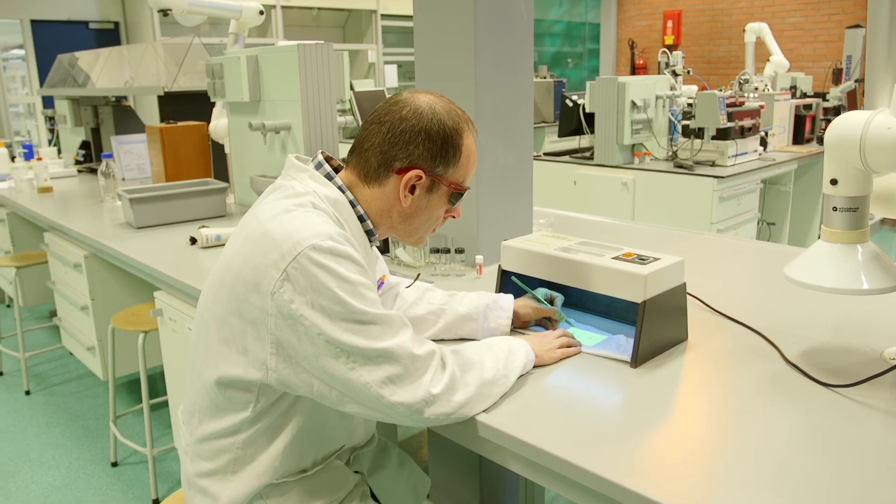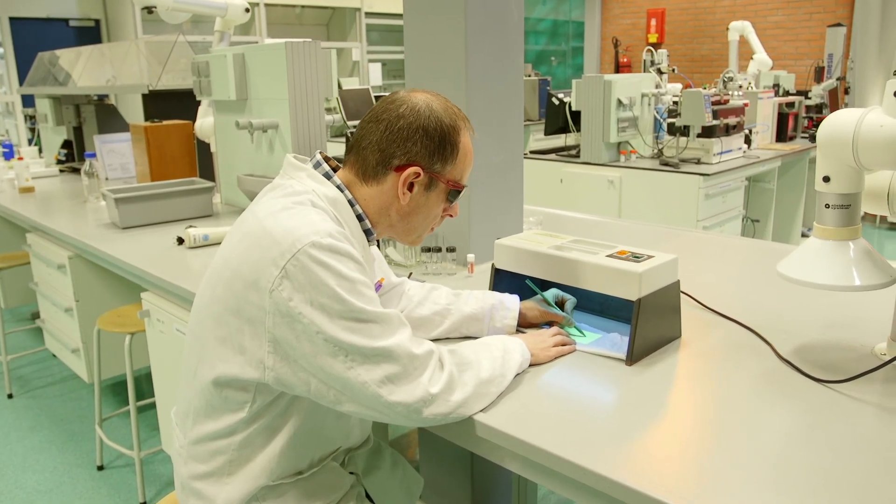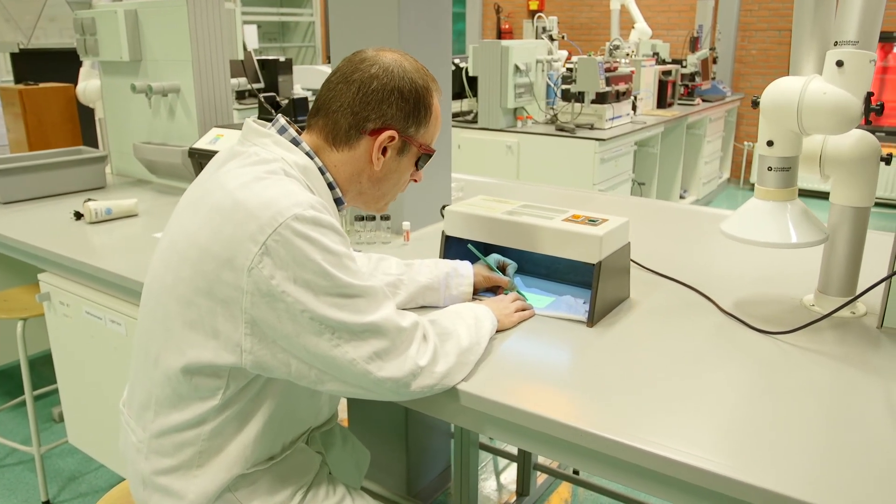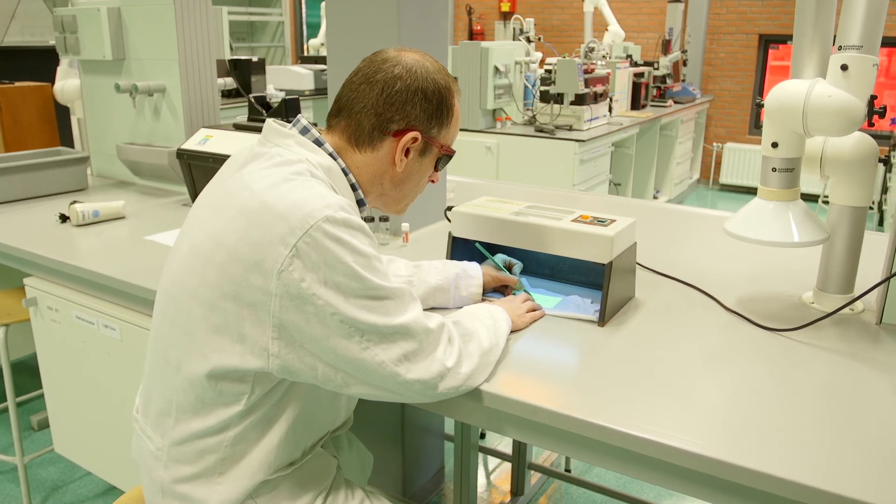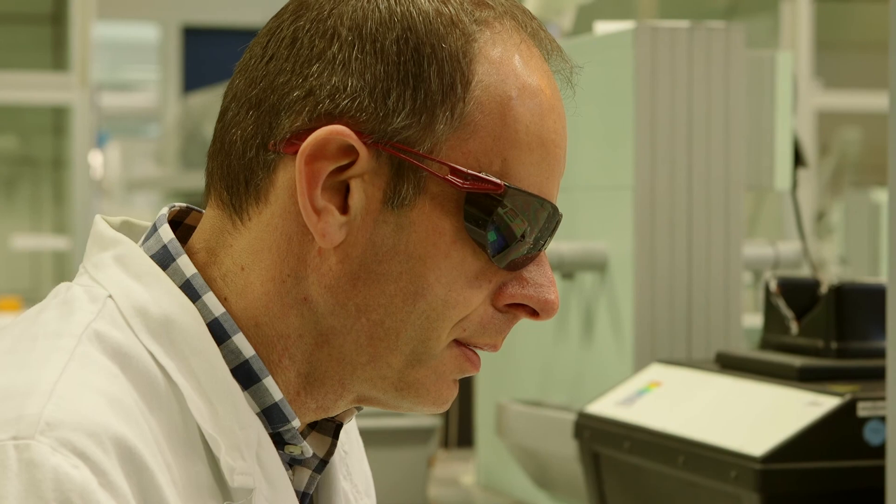The second possible method is through spraying with the reagent. Through a chemical reaction, the spots become visible. A third possibility is to immerse the entire plate in, for example, potassium permanganate. With the second and third methods, the plate is irreversibly modified and cannot be used again.